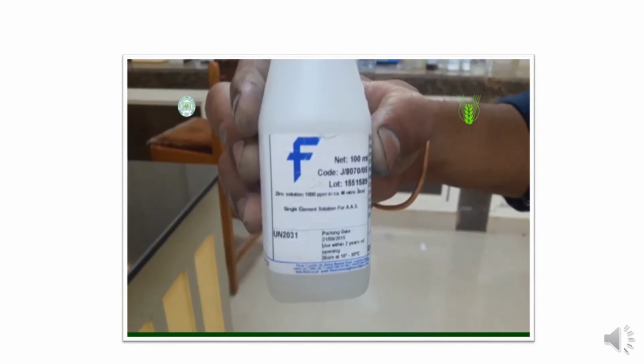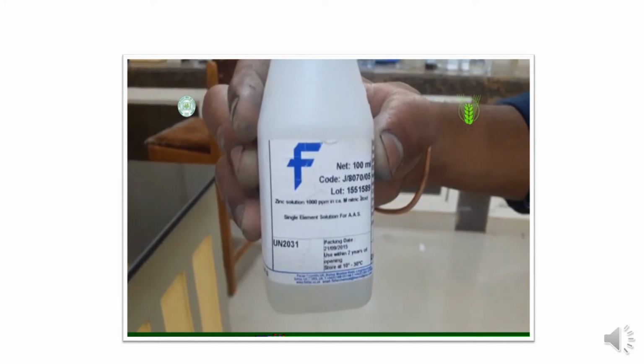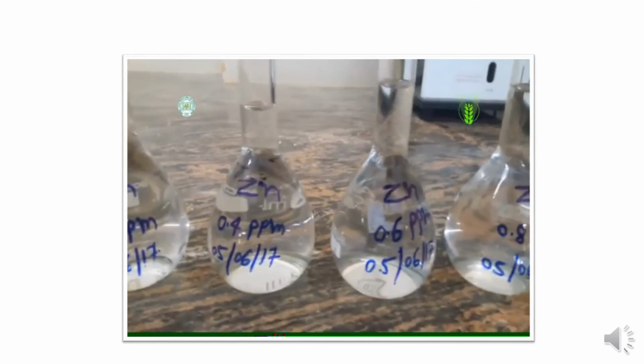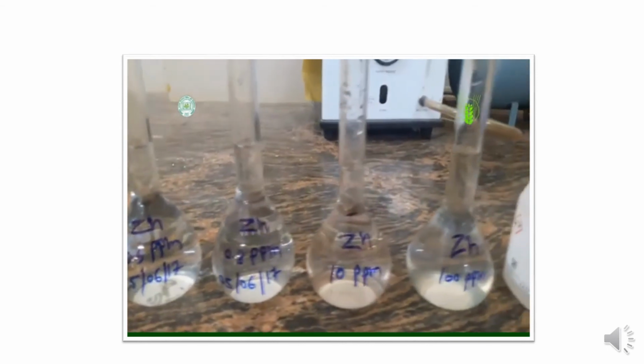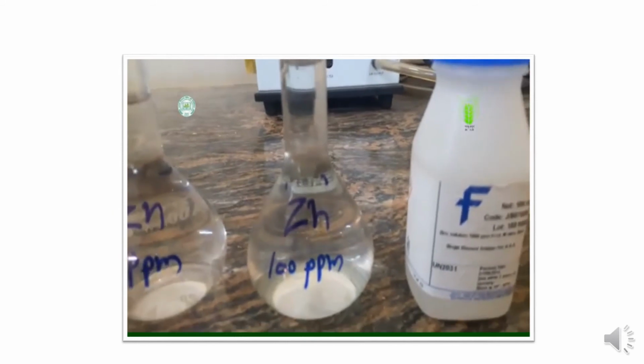So in this video you can see a different series of standard solutions for zinc are being prepared. The first 100 ppm is diluted to 10 ppm.